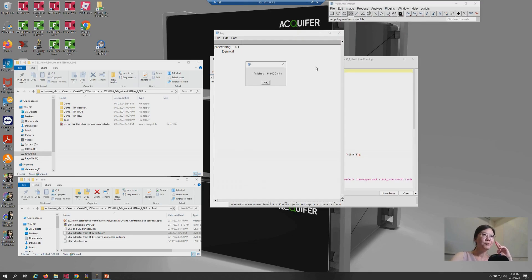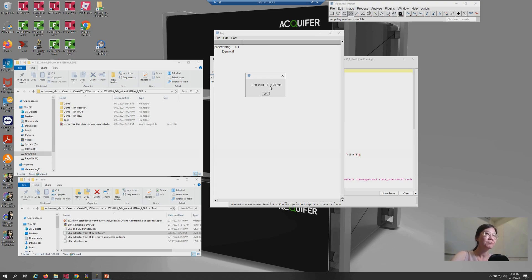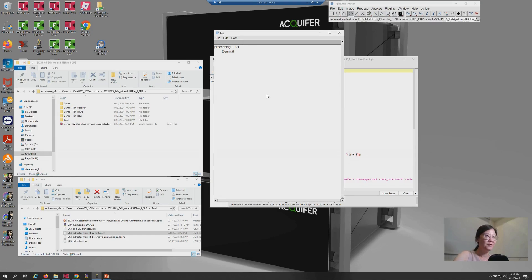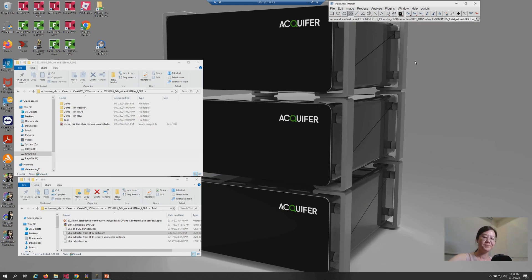When the work is done, the finish window will pop out and tell you how much time it took. So, now you can press OK to finish the work. And close all the windows here.